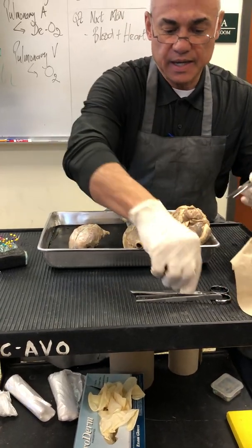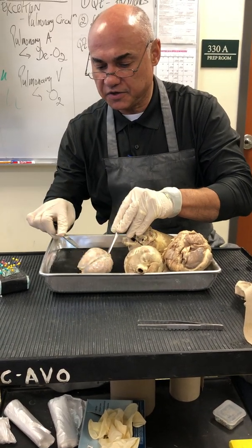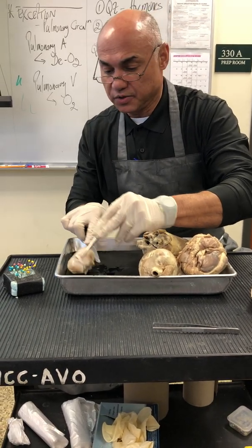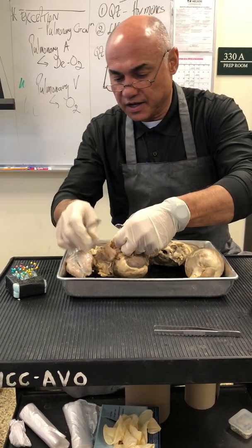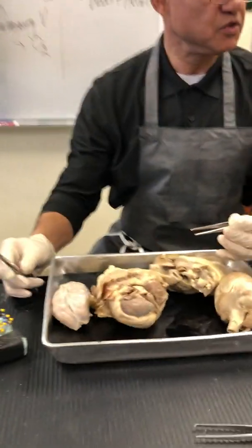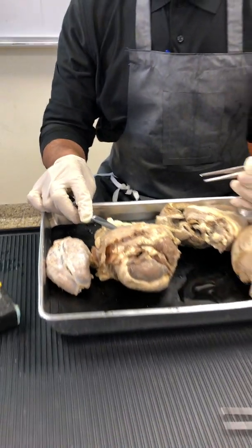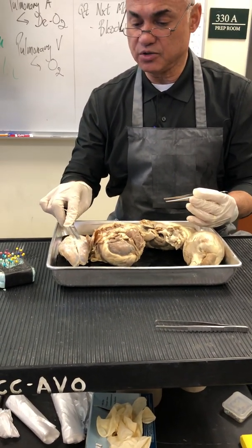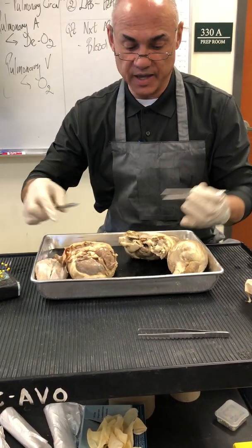For comparison, the connective tissue covering, the collagen connective tissue covering around the brain, right there, is called the dura mater. Right there is the connective tissue covering around the heart. Same collagen connective tissue covering. And what is that called? That is called the parietal pericardium, right? So we see the same thing, same collagen. Wrapping around the brain, dura mater; wrapping around the heart, parietal pericardium. Okay, so that's out of the way.